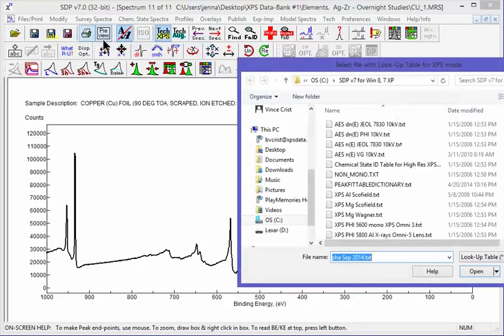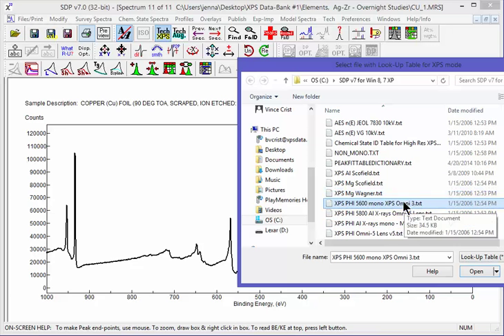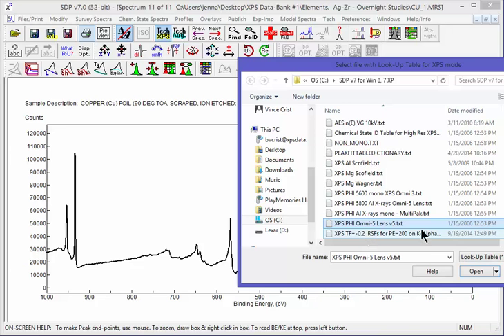Change peak lookup table. We have Auger tables you can import or use. Then down here, Schofield, magnesium. Here's from a Phi 5600. Here's a Phi instrument 5800. And down here we have a K alpha. So any one of those can be used, and you can modify any one of these as long as you follow the design rule that you'll find when you open it.